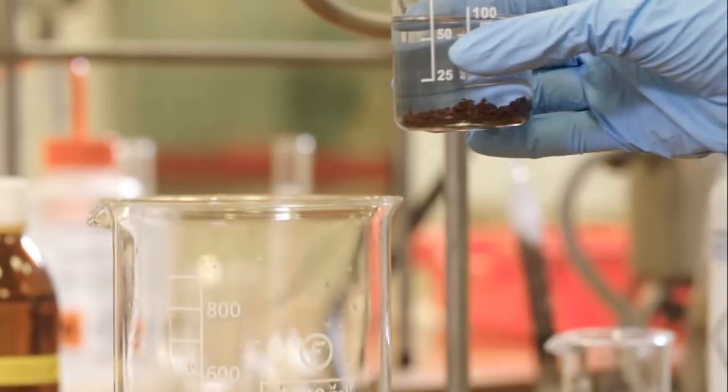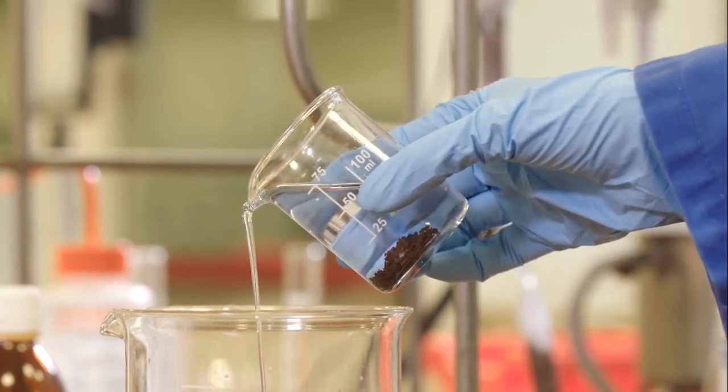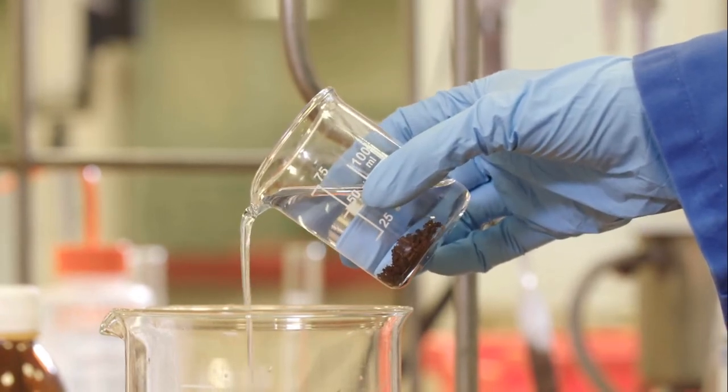The liquid from the beaker is carefully decanted into a large waste beaker. The copper that has been produced should be kept.